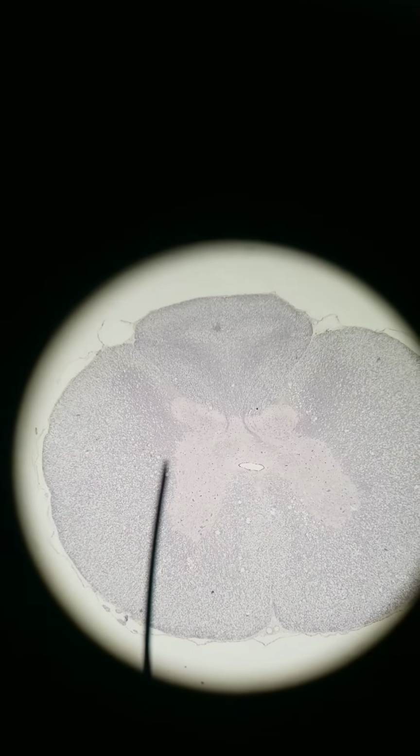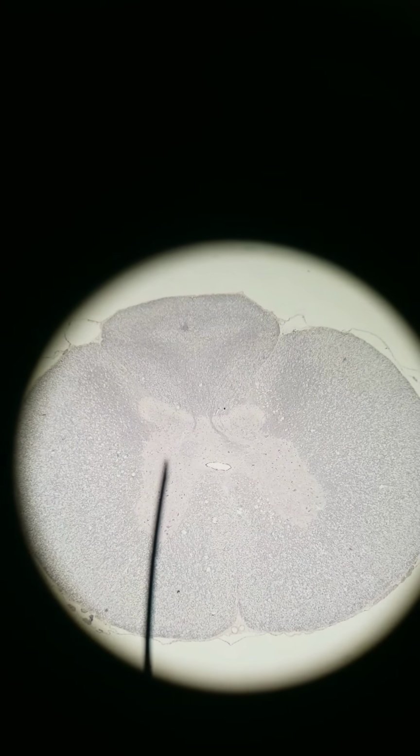Once again, this is a cervical spinal cord. It's pretty big. We go to thoracic. Whoops, wrong way. We go to thoracic. It gets smaller because you don't have arms. The cervical is bigger because you got your head and arms to send axons or deliver axons from.